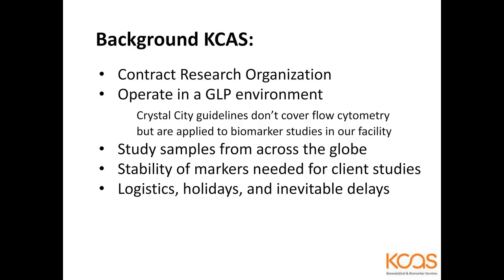So as a contract research organization, we operate in a GLP environment, which is regulated by the FDA. GLP means good laboratory practices. These are very well defined, and there are several publications, including the Crystal City Guidelines, which cover how a study should be conducted and documented. However, because biomarker studies are so new and flow cytometry even newer to the scene, they are not covered specifically in the Crystal City Guidelines. So we apply as many of those guidelines to our biomarker studies as possible.